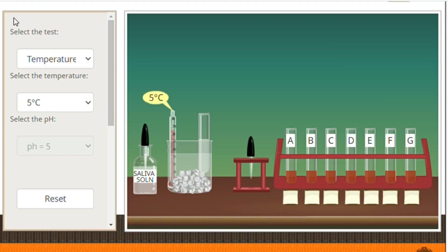For the first part of our experiment, we will be investigating the effects of different temperatures on the activity of salivary amylase on starch. We will first set our temperature to 5 degrees Celsius, then to 37 degrees Celsius, which is our body temperature, and 70 degrees Celsius.